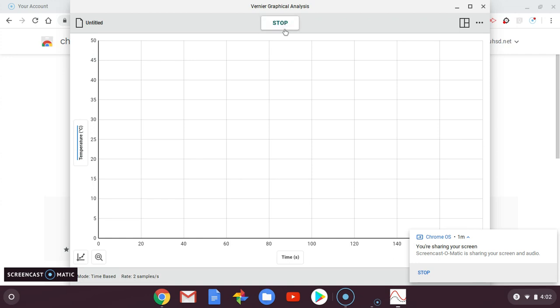You'll hold on to the temperature probe and you'll see temperature is increasing. You'll hold on to it until 60 seconds. I'm not going to go a full 60 seconds, but you can see, right now, it's starting to get close to 20 seconds. We're going to go all the way to 60 seconds. Once it gets to 60 seconds, you'll press stop.